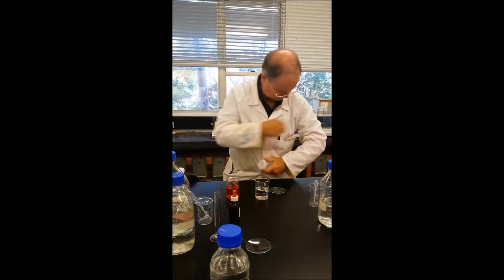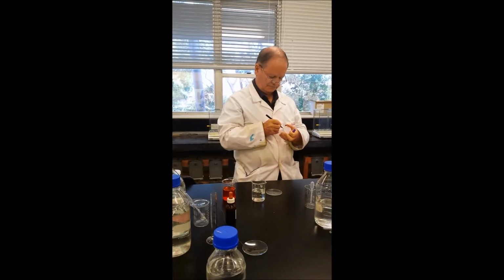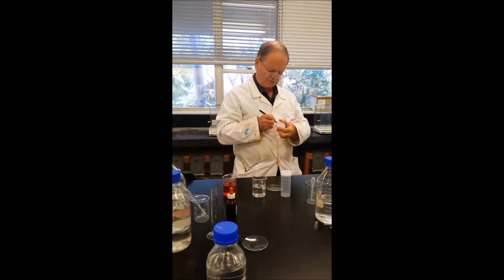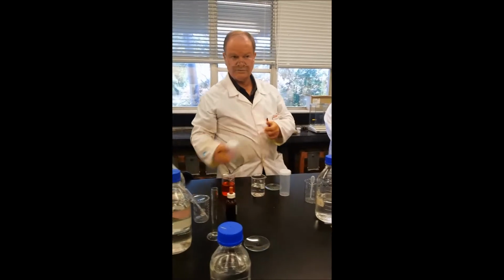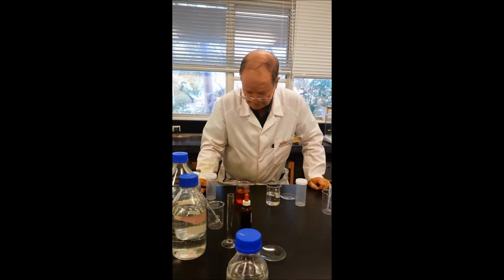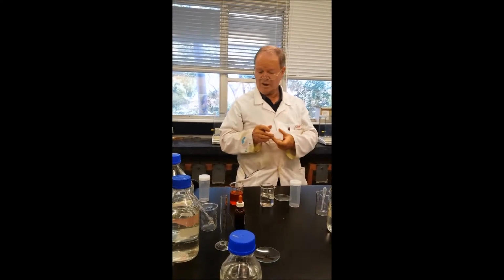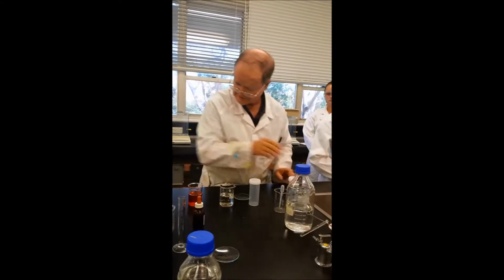Okay, now phenolphthalein. That one, methyl orange. You have to put your name on it. What's our class number? Is it 19411? Or is it our class number for the label? Do we put our class number on the label or not important? No, don't bother about the label, just write it on it. Okay, and this will be starch. Now, what's the group name? What's this group called? Okay, well, we'll put that up. Okay, now, starch over there, methyl orange here.